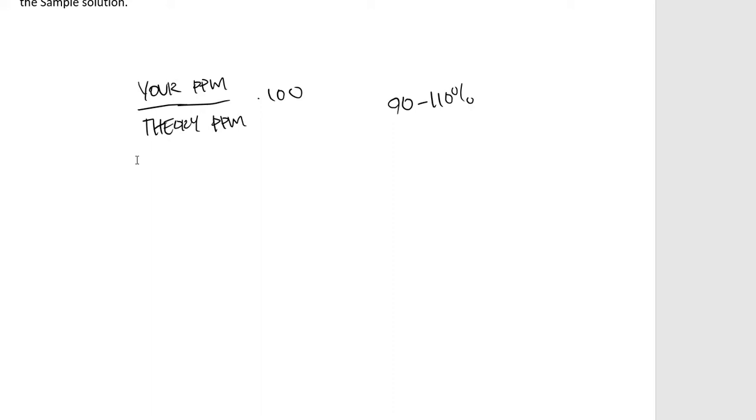The disintegration is purely qualitative. In your lab book, you're just going to write down, did it break apart or did it not? That's really all that you do there. Dissolution requires a little bit more math, okay? All right, so that's it for the dissolution and disintegration.